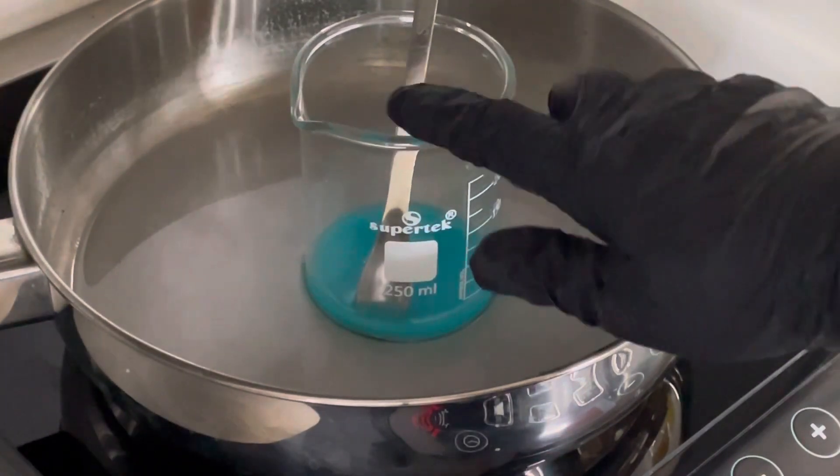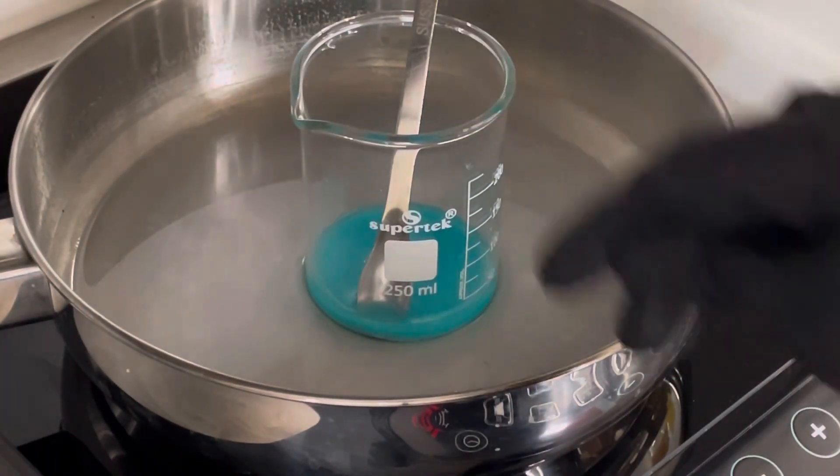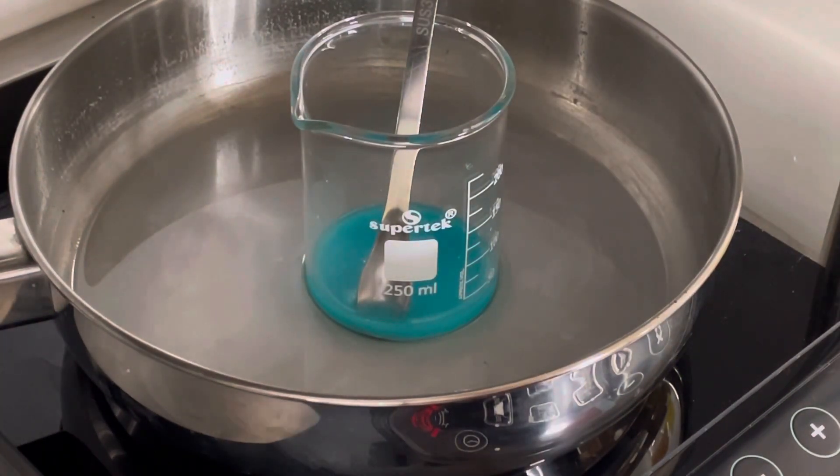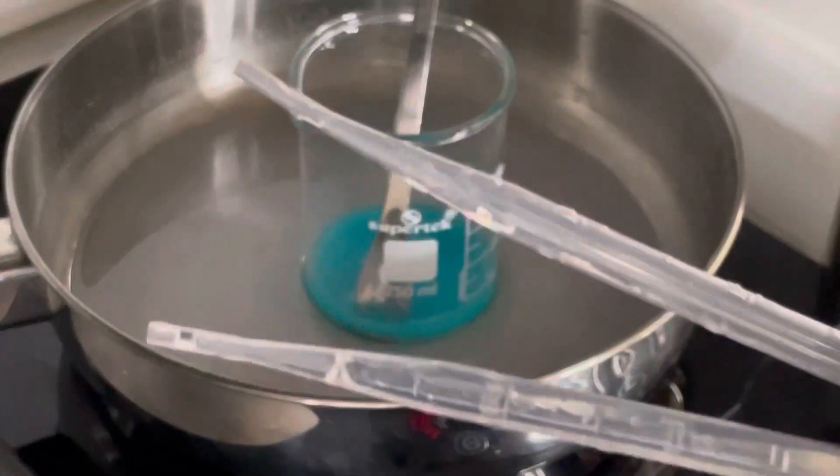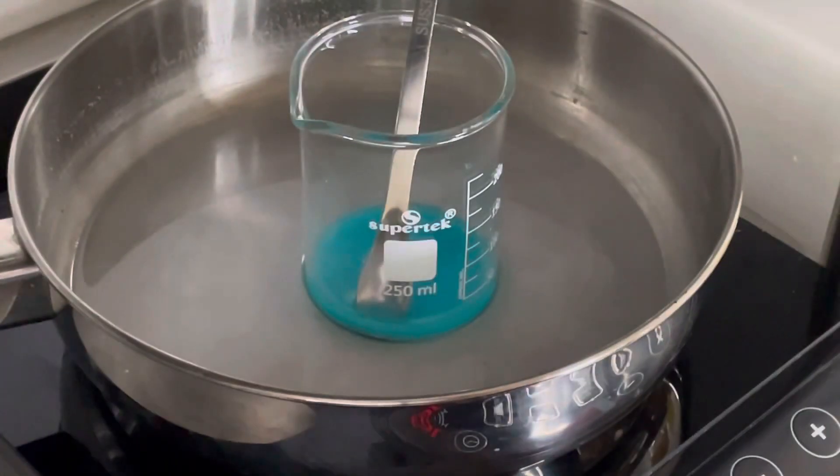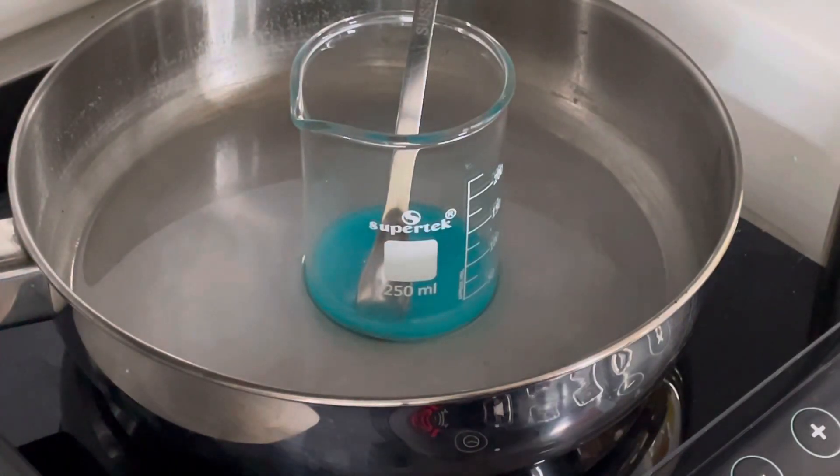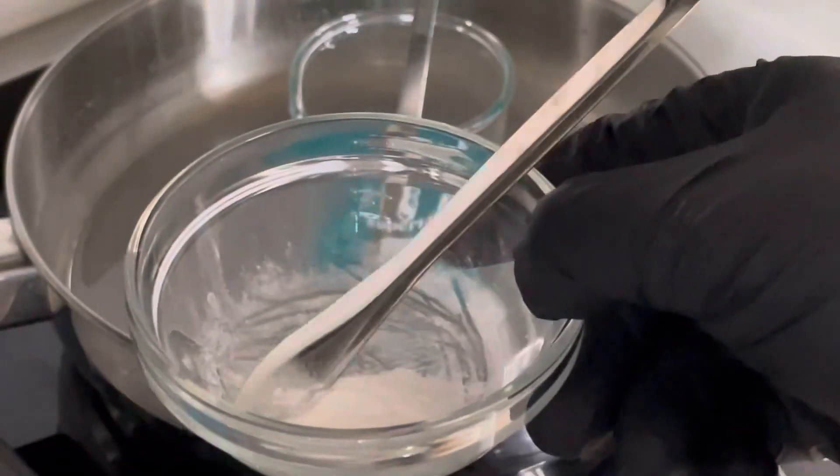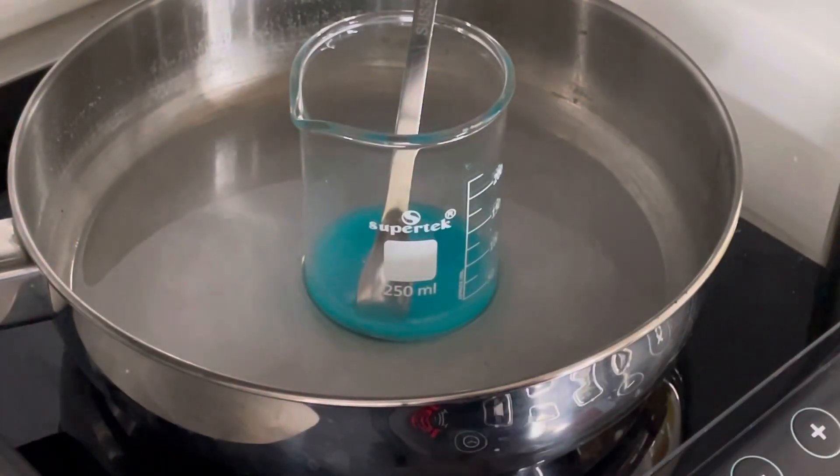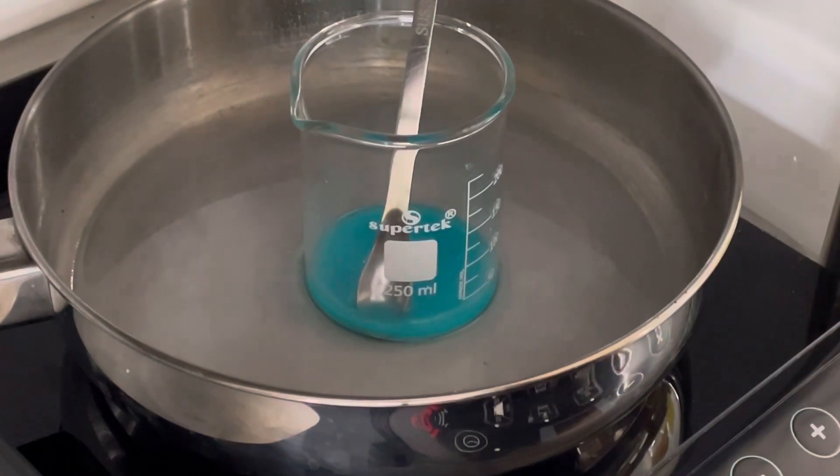So this beaker here has everything except for the sodium stearate, preservative and fragrance oil. So we're going to heat all of that up, we'll call that phase A, let that get to temperature and then we can start adding our sodium stearate just as we did before.